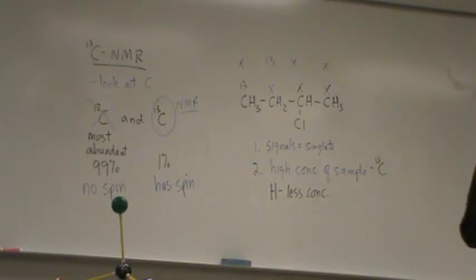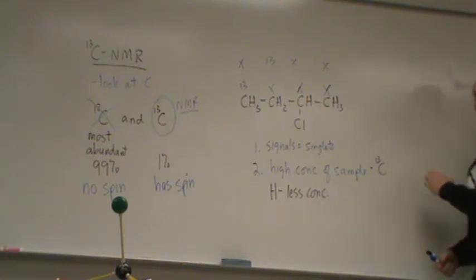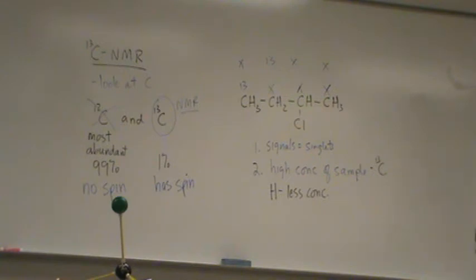If you did a high concentration, then you would saturate your NMR instrument and you would get a messy spectrum. You get peaks real high and everything. But for C13, I want it as concentrated as possible. So I just keep stuffing sample into solution.